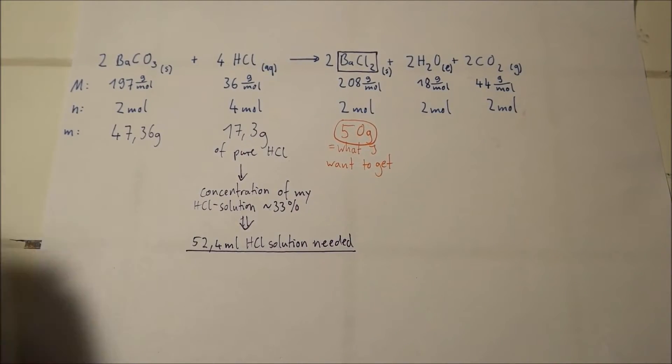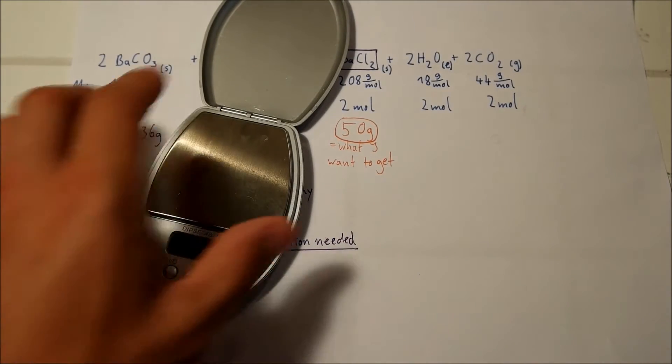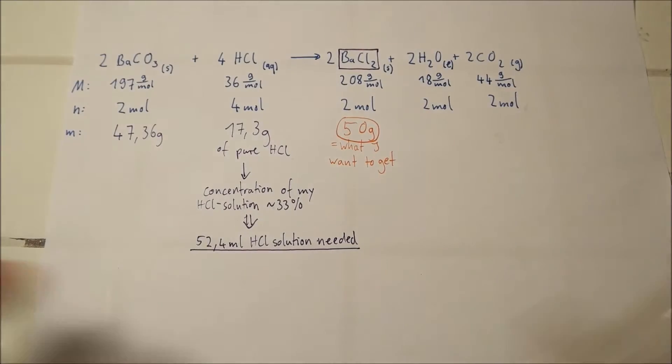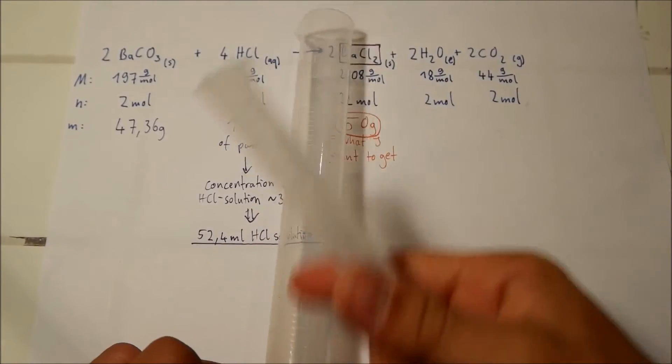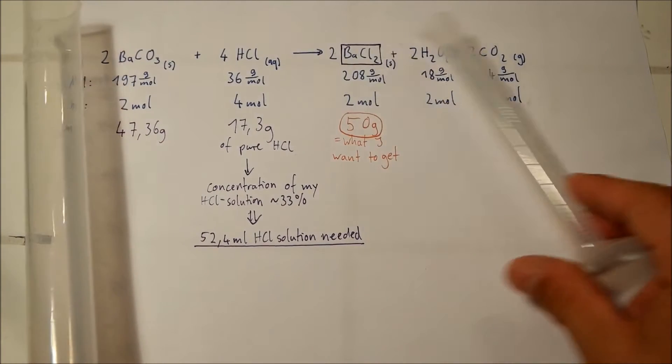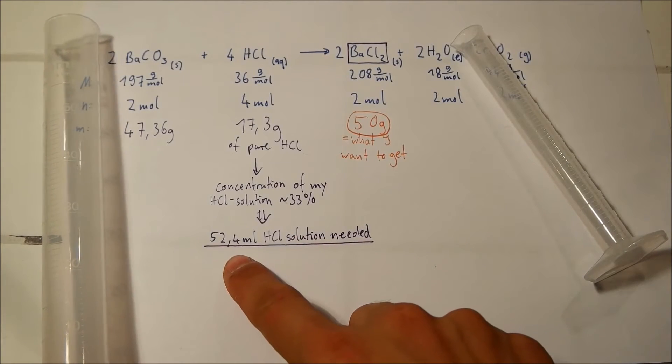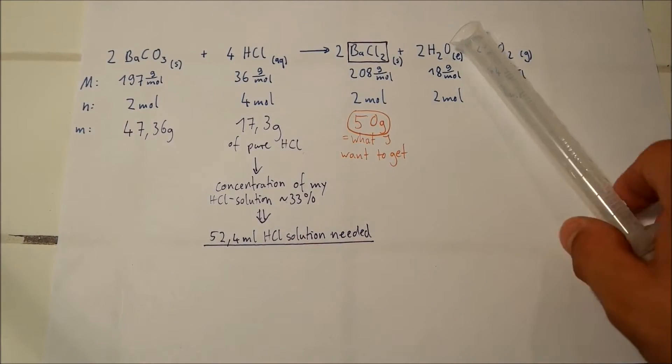To get the right amount of my chemicals, I used those cheap scales and graduated measuring cylinders. This one has 50 milliliters and this one 10 to get my 52.4 milliliters of HCl solution.